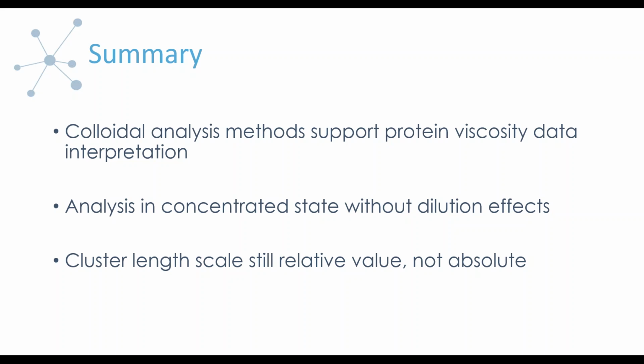I will point out, though, that at the moment, until we have some more data worked out, we're still looking at things on a relative rather than absolute scale. So that's why when I present the data, I'm looking at how things are trending when we change some particular aspect of either the environment or the formulation.